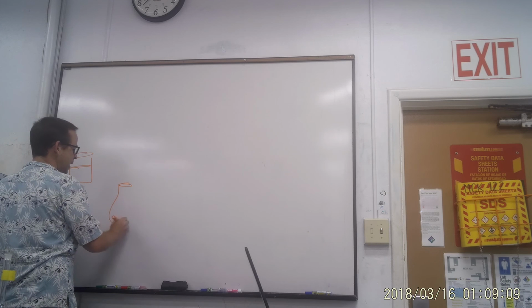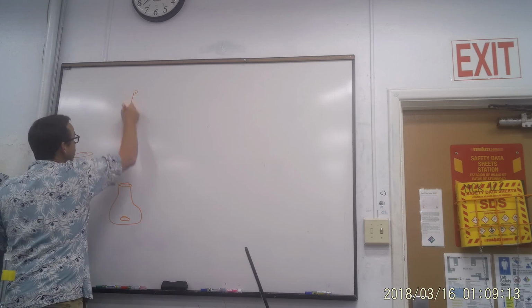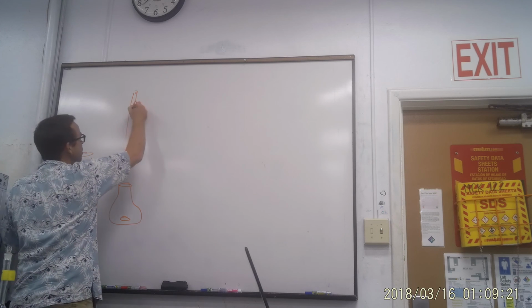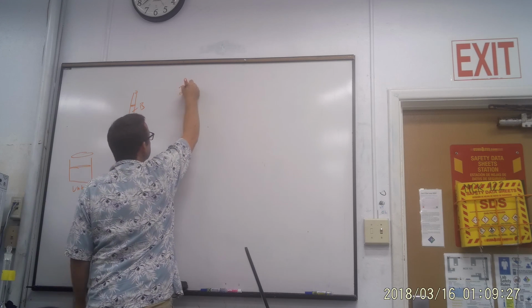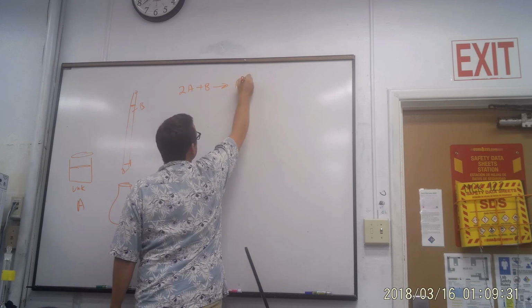I'm going to perform a titration. I have here in my burette chemical B. I know the chemical reaction: 2 A's plus a B equals A2B.